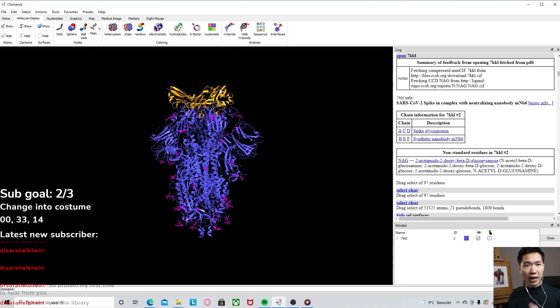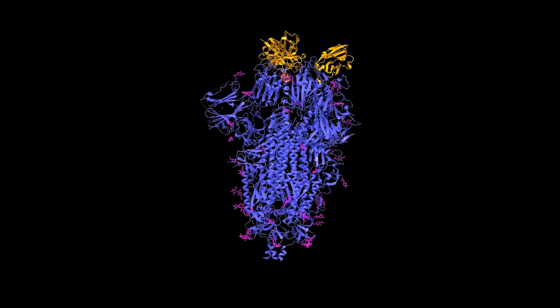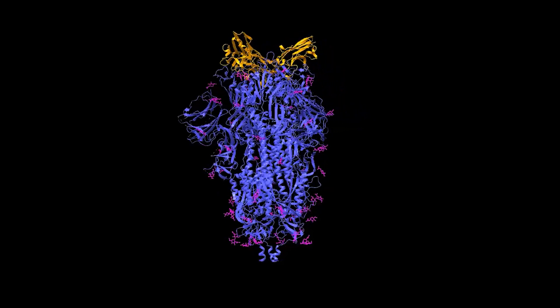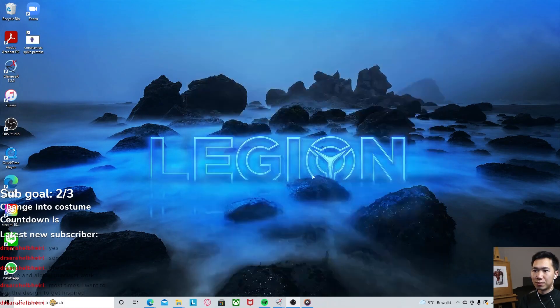This is what I will be showing you how to make in ChimeraX, and it is an open source free software. You can make very beautiful 3D protein models and export them for your research publication.